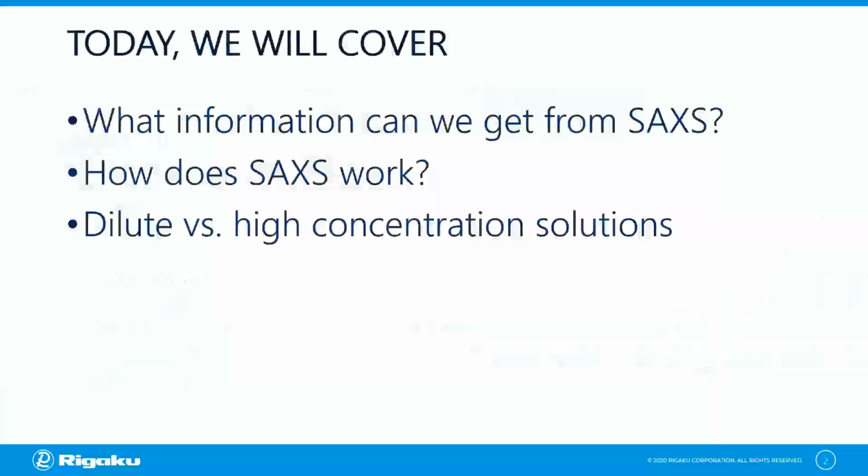And in this particular presentation today, the things that we're going to cover are, we're going to look at what information we can get from SAXS. We're also going to look at how it works, and then we're going to look at dilute and high concentration solutions, maybe some ordered things, and we'll give you some examples.